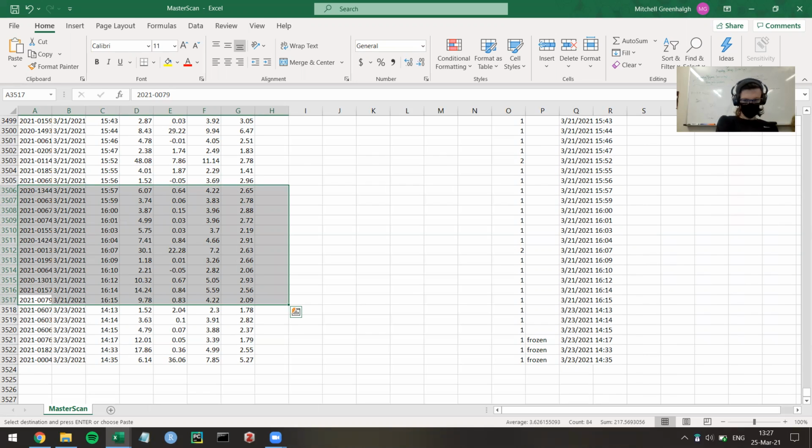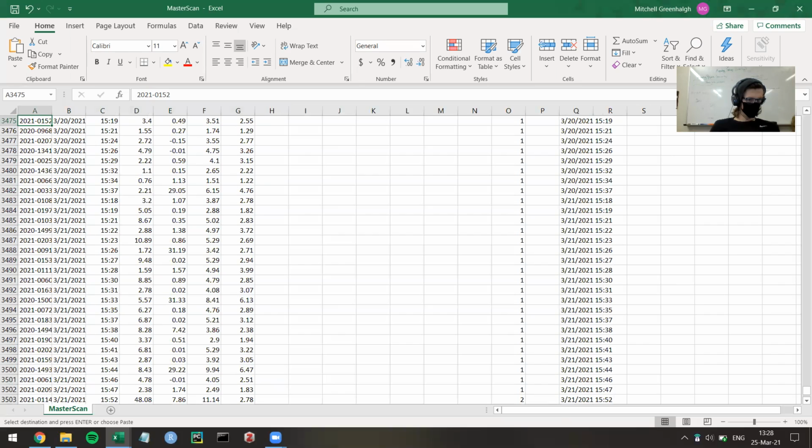Except that is the correct, yeah, that's the correct stuff. So if we go back, those samples were actually run on the 20th. Here they are. So it's these samples.